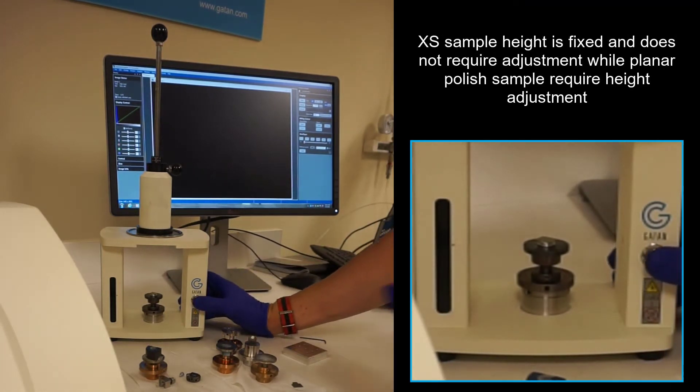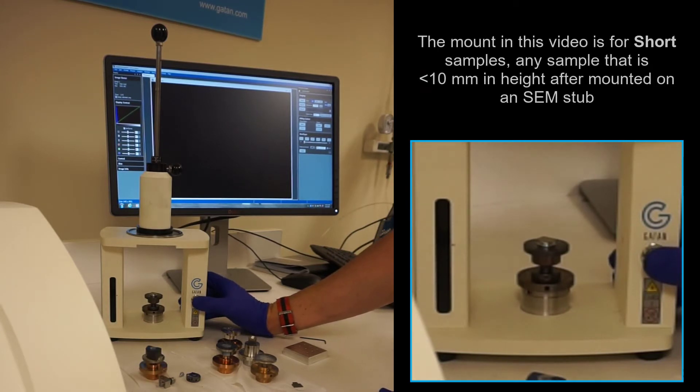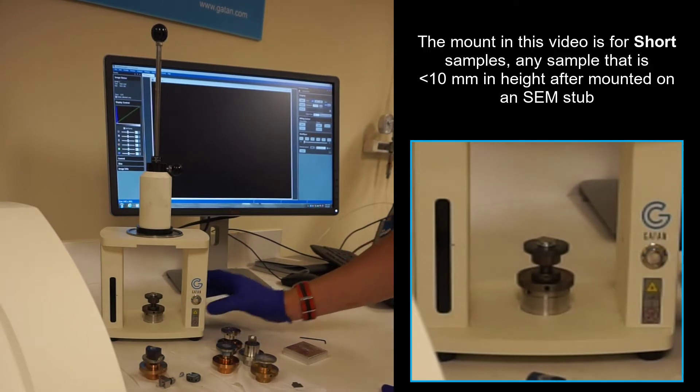To set the correct height, when doing a cross-section, the height is always correct. But when doing a planar polish, the sample height will vary.